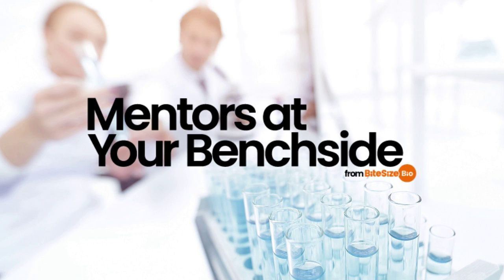Furthermore, basic conditions and detergents such as SDS interfere with the dye's ability to bind to proteins, but there are detergent-compatible Bradford reagents. Number 3, the bicinchoninic acid, or BCA, assay. Originally developed in 1985, the BCA assay is another colorimetric assay.